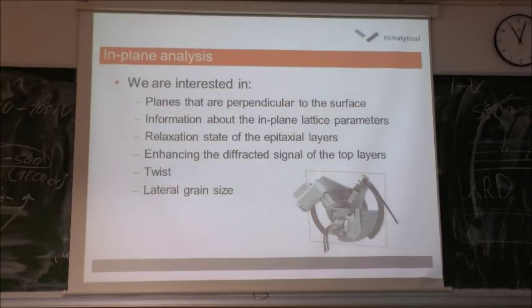Then another application is in-plane analysis. This is the so-called real in-plane, when you put the cradle completely into the out-of-plane geometry. So we analyze planes which are perpendicular to the surface. In this way you can get information about in-plane lattices. Basically you can get all this information also from RSM, but sometimes this is even more accurate. You can see what is the relaxation state of the layer, and you can get more signal from the top layers.